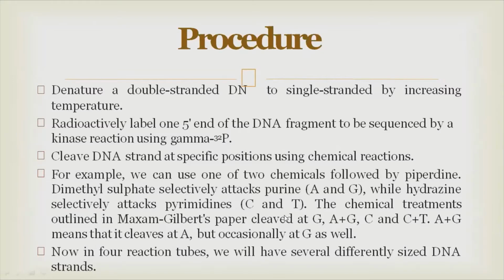Okay? So accordingly, he also did three to four reactions for the same. A plus G means that it cleaves at A, but occasionally at G as well. That means in this particular reaction, A plus G, it will definitely cleave at A, and whenever it encounters G, it will cleave at the point of G as well.